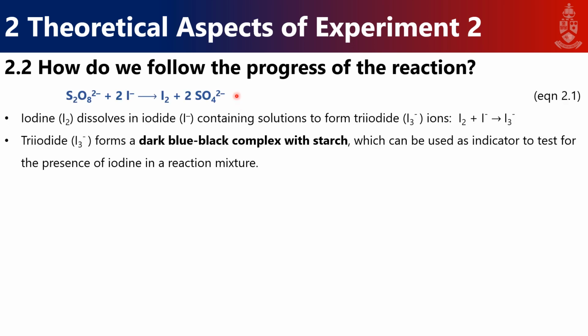So how do I follow the progress of my reaction? My persulfate will react with iodide to form iodine and sulfate anions in solution.